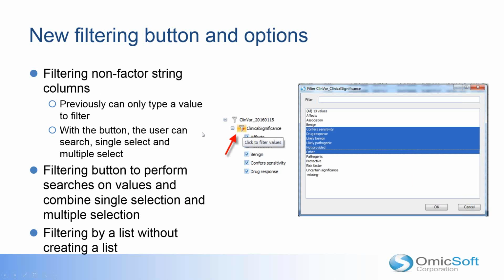This is what we think is probably the most important graphic user interface improvement in 2015. Even though it probably has been widely used, I still want to point it out. So for those of you, you might wonder, there is a button for each query. What does this button do? You probably never tried to click it, but try.